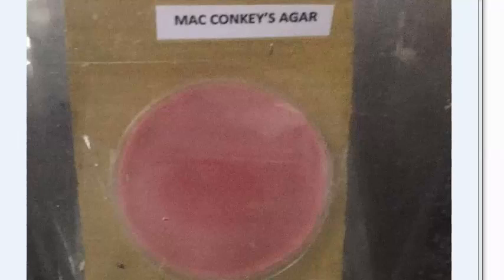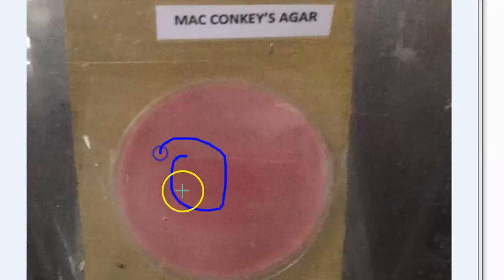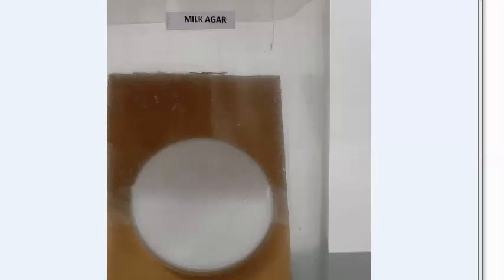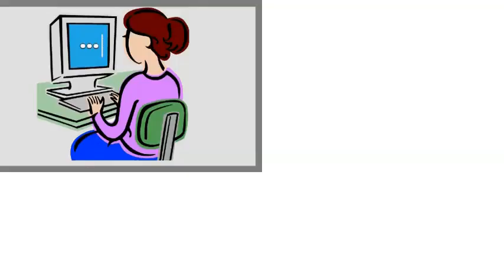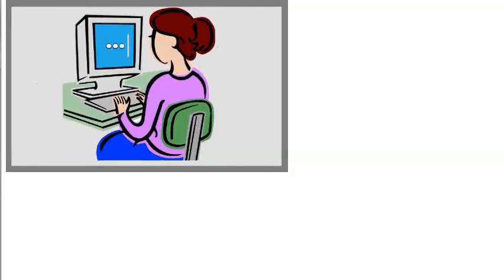MacConkey agar is used for Enterobacteriaceae — E. coli forms pink colored colonies here as lactose fermenters. It contains peptone, agar, lactose, and neutral red as the indicator. Milk agar contains nutrient agar with milk added and is used for Staphylococcus, where color differences are observed prominently.